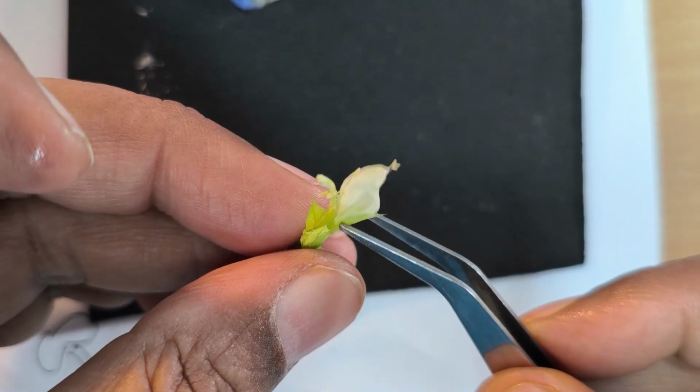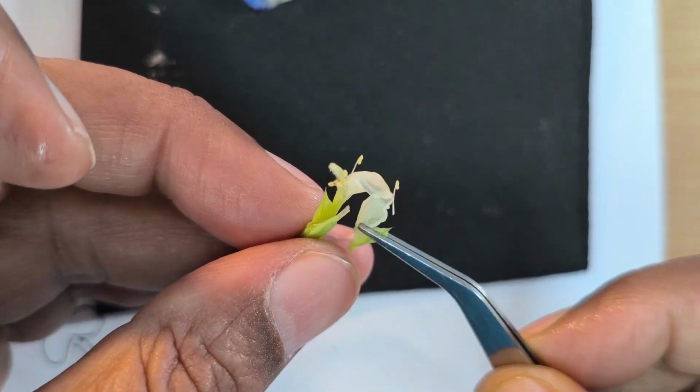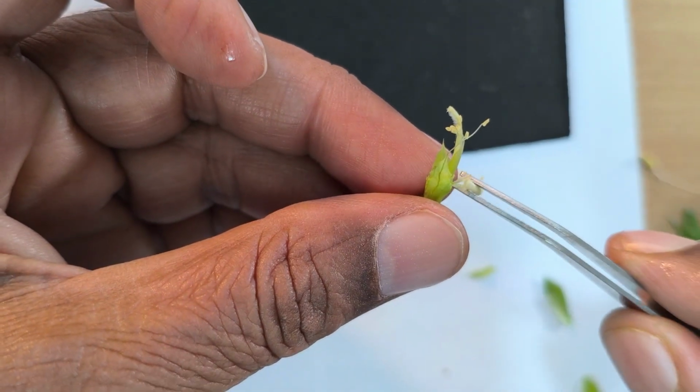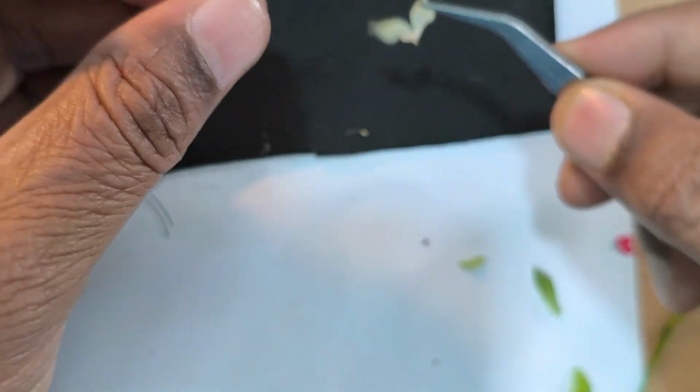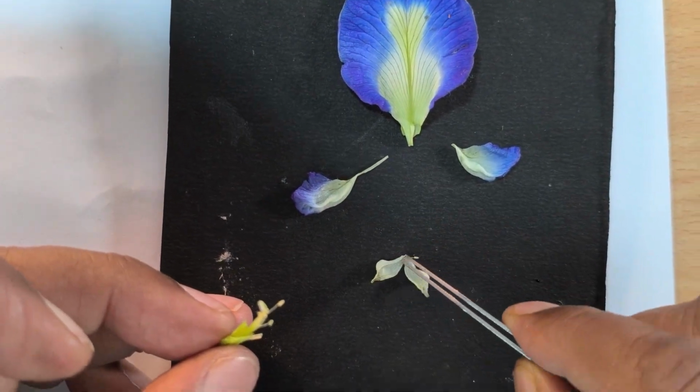So I have to carefully take this out. Yes, it has come nicely. You see, it is so jointed.